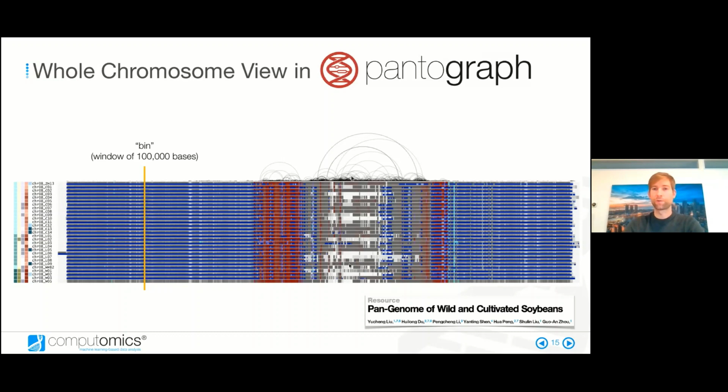This is the centromeric part of the soy genome. This is located here and contains the most variation. In blue, you see genic regions. So all these assemblies were also annotated. And that also makes biologically sense. All the genes are mainly found on chromosome arms of soy genomes and of many other crop species.